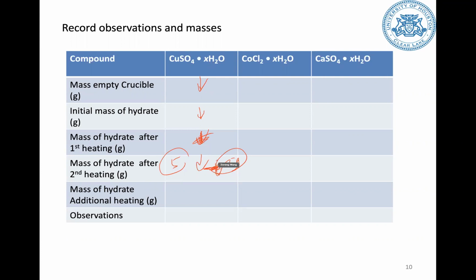Say you have this one, 28.95, and the second one, 28.75. You see the difference, right? Then you record 28.65 and 28.63. Now here you see this difference is less than that. So you need to record them to show that. But you need to describe how many times you repeated that. Others you can describe somewhere, but here you can make another row to record all those numbers.